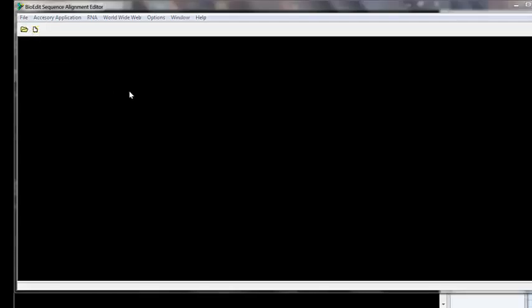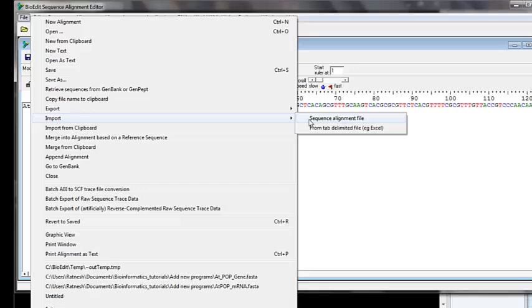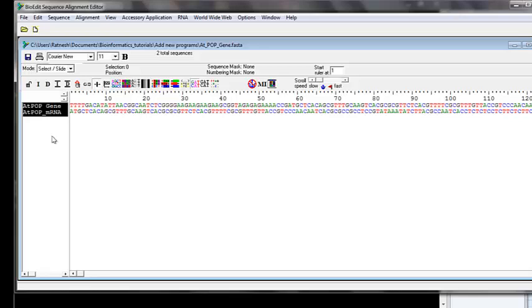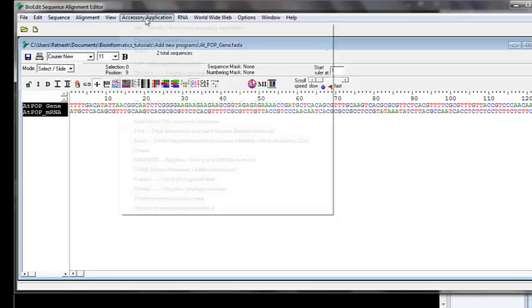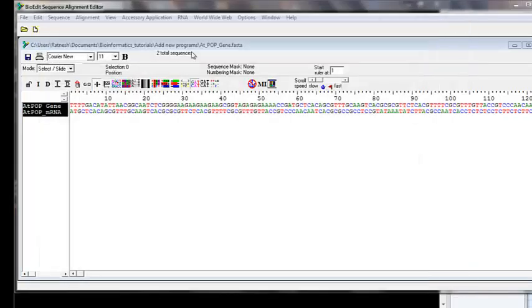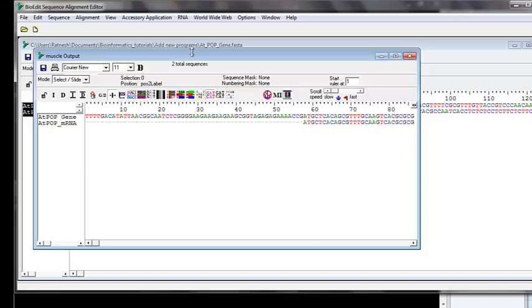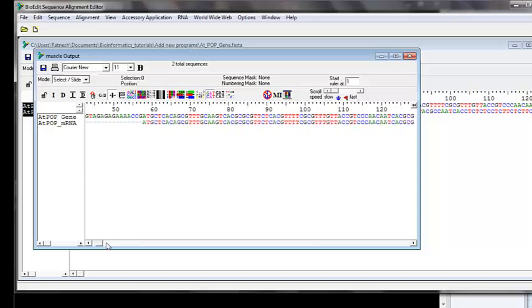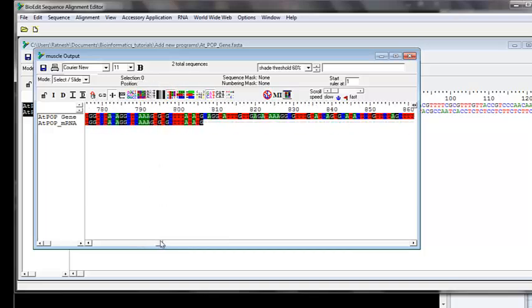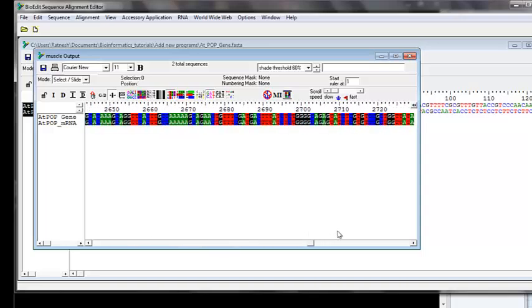Let's test this. Restart BioEdit, open a file, go to Import Sequence Alignment, select the sequences, press Ctrl+A to select all, then go to Applications > MUSCLE > Run Application. It did the alignment — it aligned the sequences using MUSCLE instead of ClustalW and did a pretty good job.